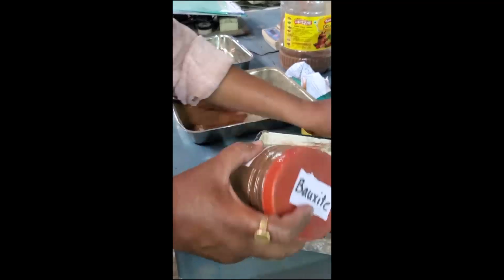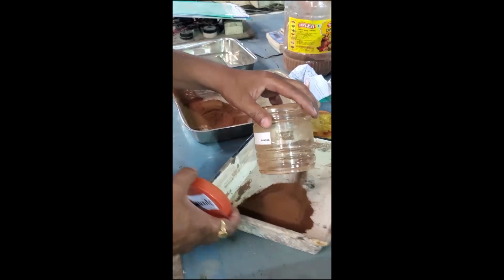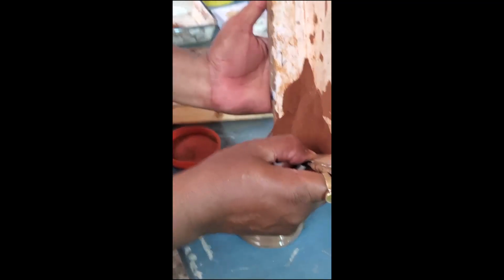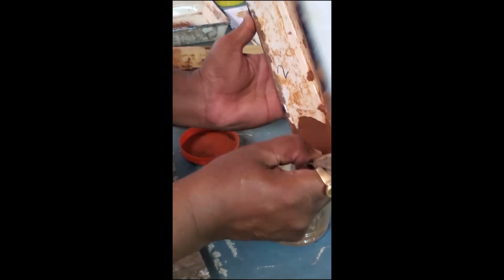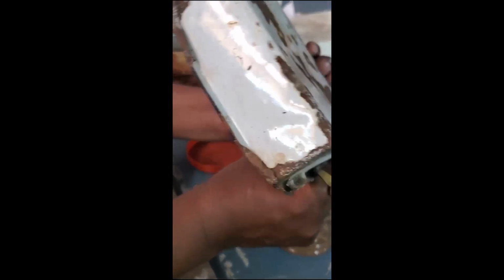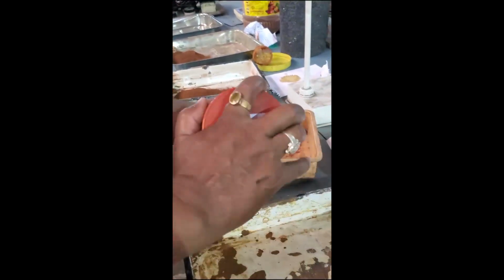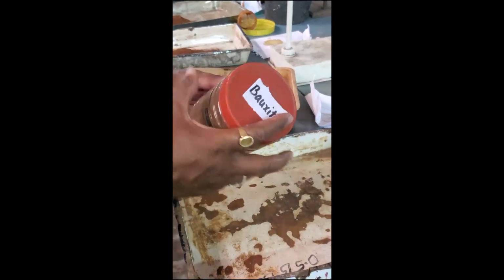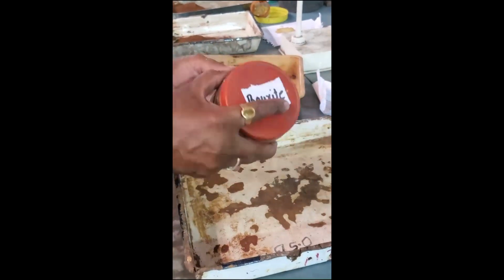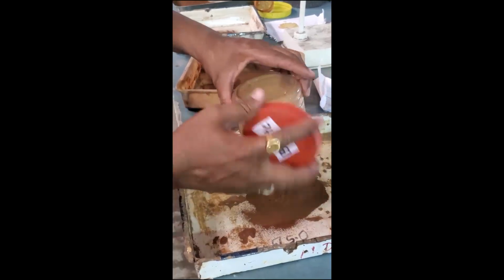Like that you can do for the remaining 2 trays also, for getting the uniform mixture. So this is the fifth tray, the final tray. 4% of bentonite will be added. Just shaking the mixer. And we are pouring into the same tray, because after this we have to add water.